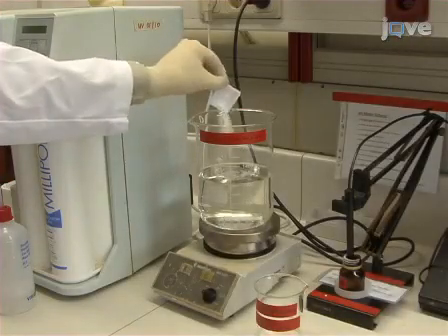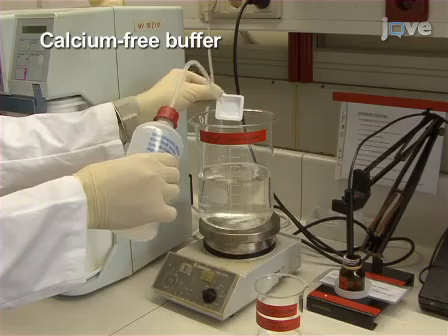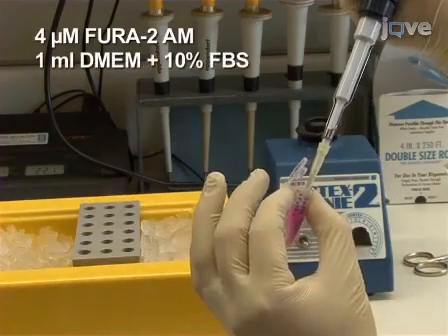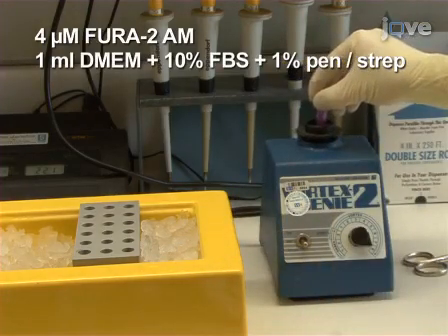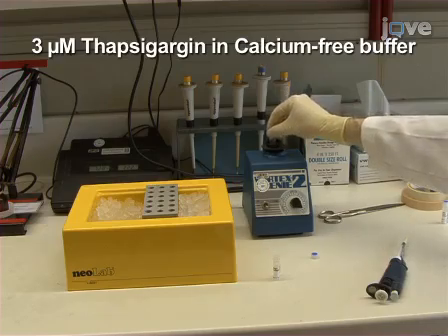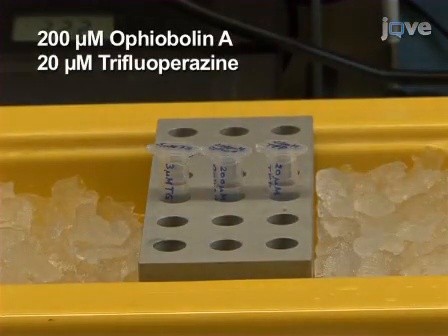Begin this procedure by preparing the solutions and reagents to be used. First, prepare calcium-free buffer according to the instructions in the accompanying written protocol. Next, dilute a stock solution of the calcium indicator dye Fura-2 AM into 1 ml of DMEM containing 10% FBS and 1% penicillin streptomycin to a final concentration of 4 micromolar. Dilute a 1 millimolar thapsigargin stock solution in calcium-free buffer to a final concentration of 3 micromolar. Also have on hand 200 micromolar ophiobolin A and 20 micromolar trifluoperazine.